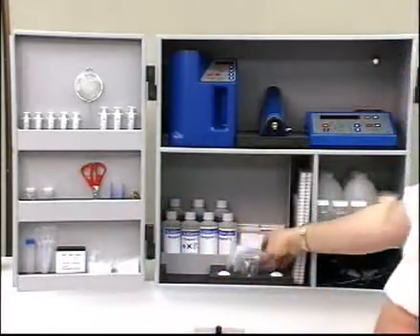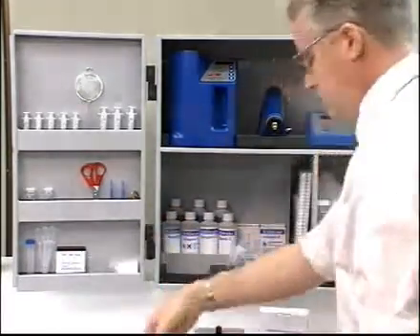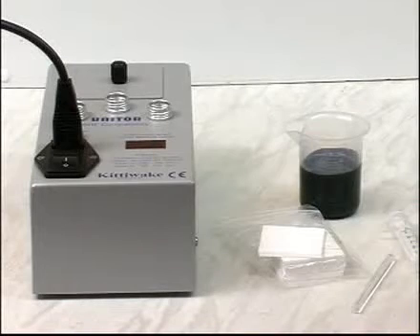This section shows you how to test the stability of a fuel sample and how this can be used to test the compatibility of two fuels. The compatibility test unit is fitted with a timer.